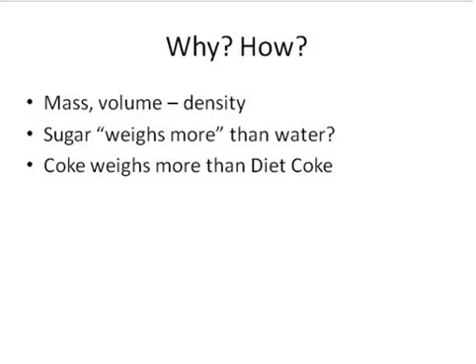In this case, we will be using a couple of different physical properties to measure the amount of sugar in Coke. So we'll be using measurements of mass and volume, and we'll be combining masses and volumes to produce a new property, an intensive property. Intensive means doesn't depend on how much stuff there is, but it's an inherent property of the substance called density. And density is the mass per unit volume. The unit on density is grams per milliliter, the unit that we'll be using, although there are a variety of different units that could be used.